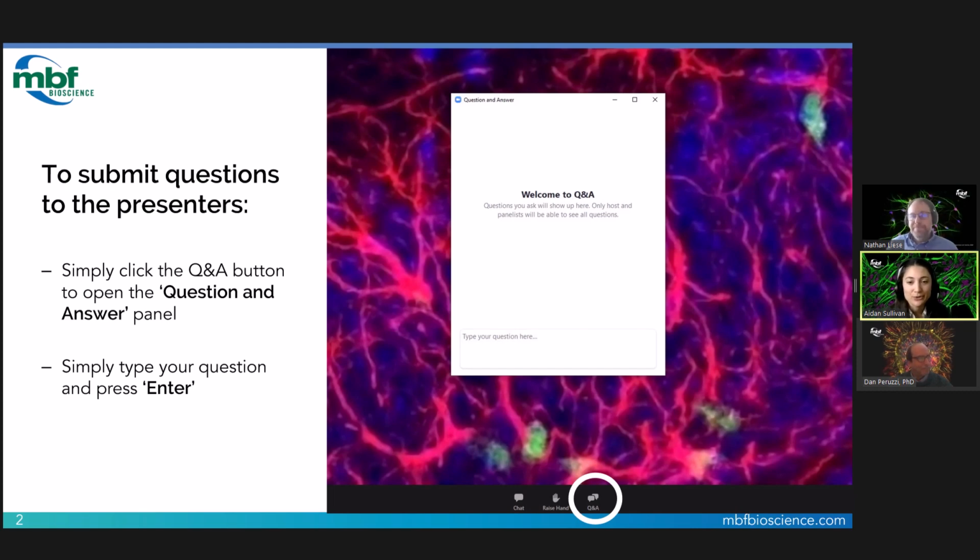Hi, everyone, and thanks for the introduction, Nate. And Dan, I'm so glad to have your help today as I start this new research project. I am trying to estimate the cell population in the right dorsal part of the anterior cingulate area in the mouse brain to determine if there's a difference in cell numbers with treatment. My problem is I have no idea what to choose for my stereology parameters.